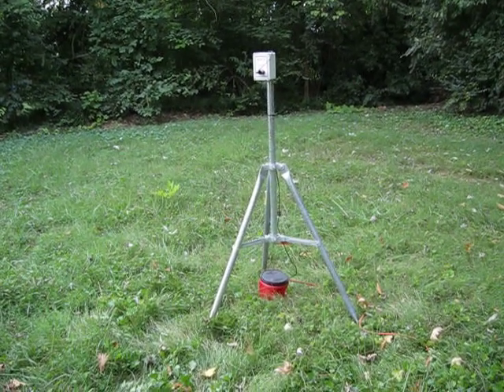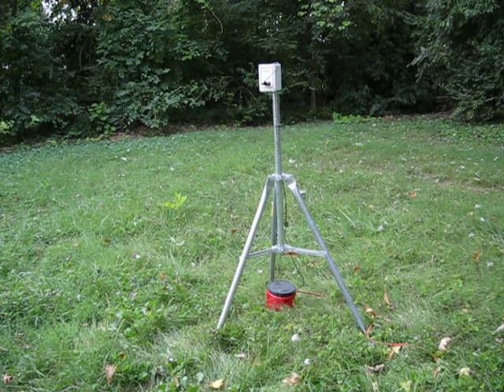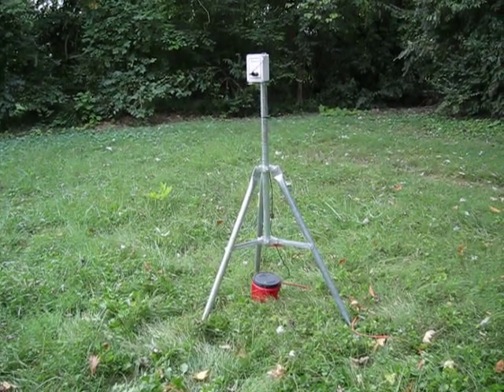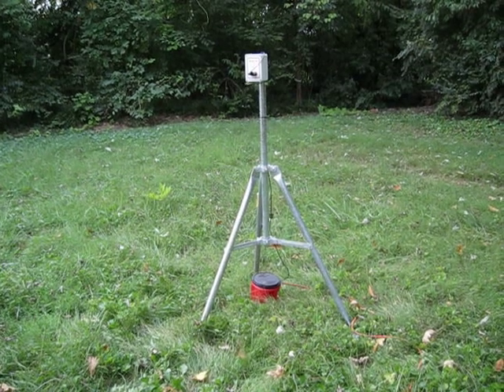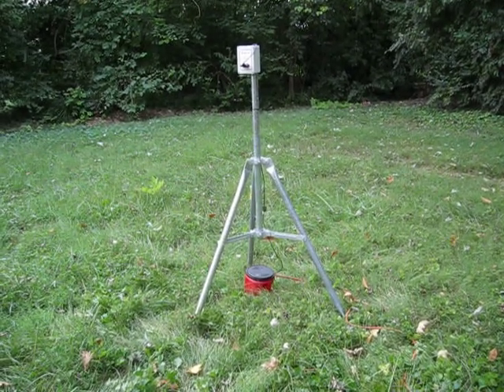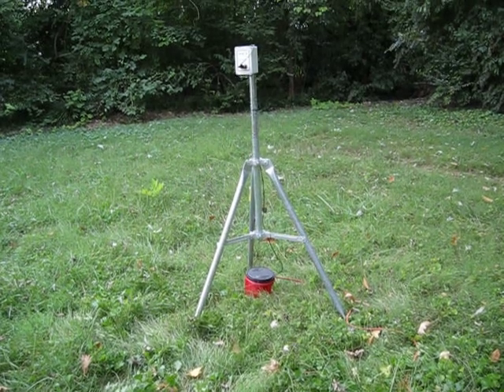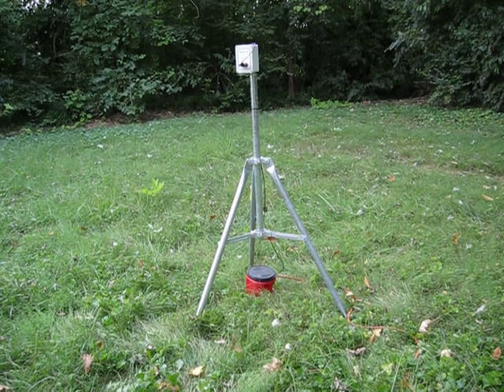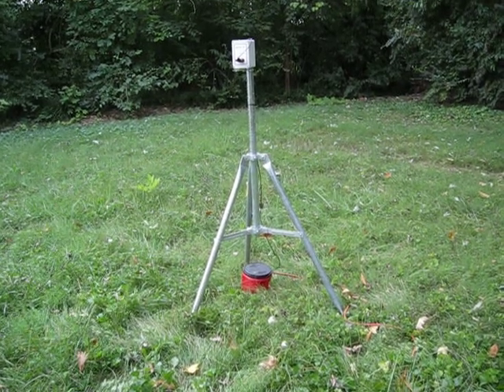What you're looking at is a Rotorod Model 20 sampler set up in a suburban backyard in West Knoxville, Tennessee. The Rotorod sampler is collecting a sample of pollen grains and other small particulates in the atmosphere here on this mid-September day.